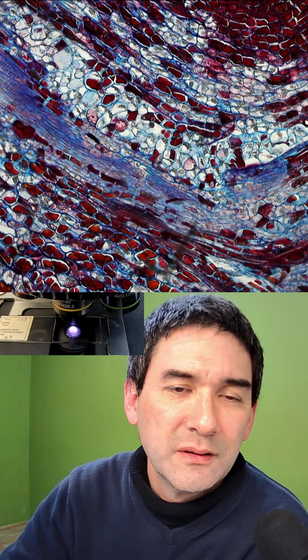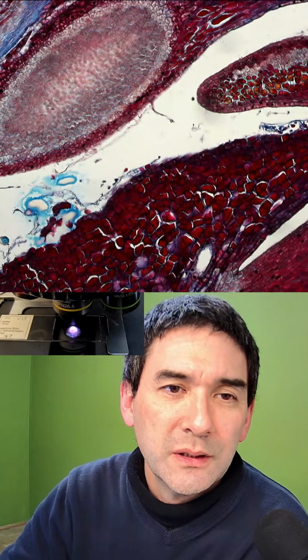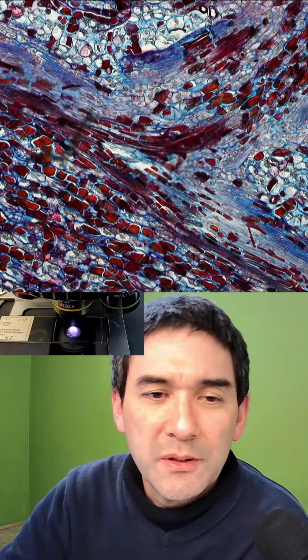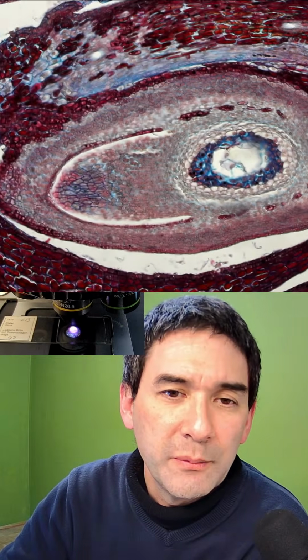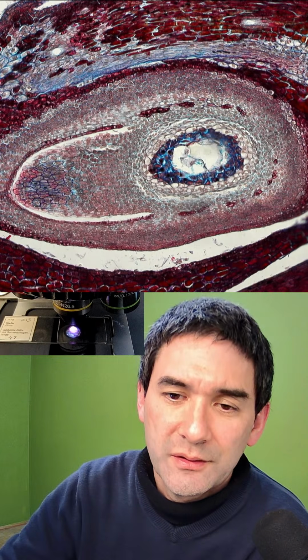So where is the scope view here again? Need to refocus it a little bit. Yeah. Also properly stained, properly prepared. And those round things here, I suppose, there must also be the ovules, which will then develop. I think this one over here will then develop into a seed.